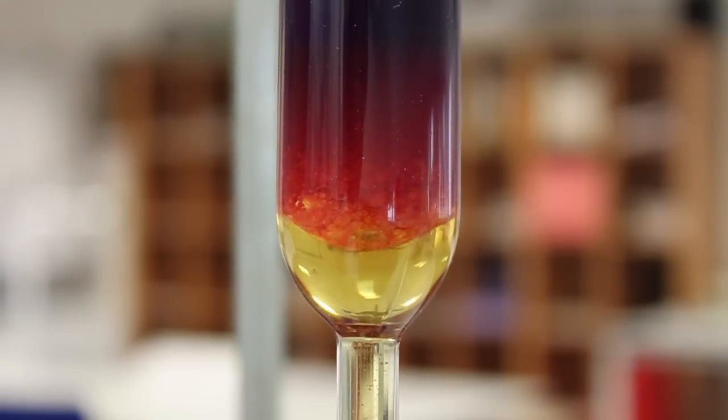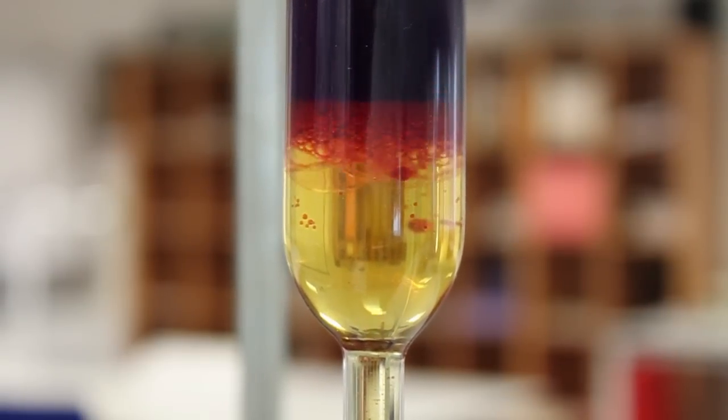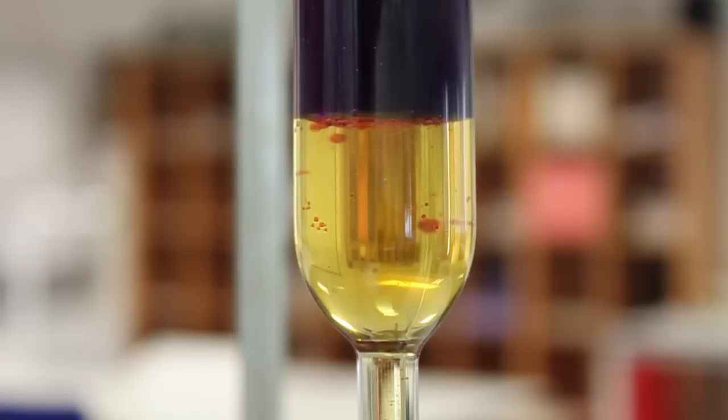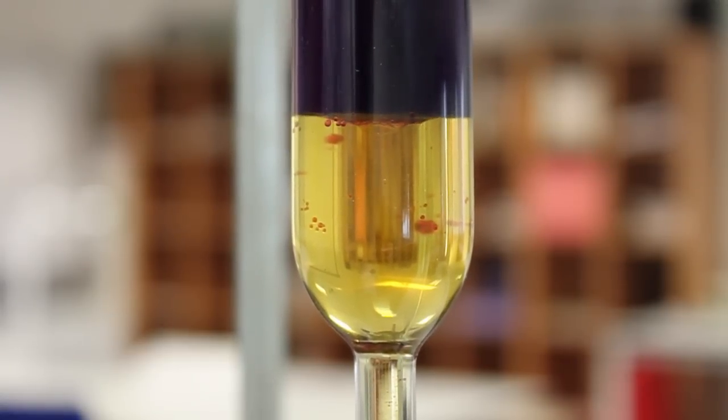Make sure to keep the lid firmly in place during this. The contents can now be left to settle into layers. The aqueous and organic layers are now ready to be separated.